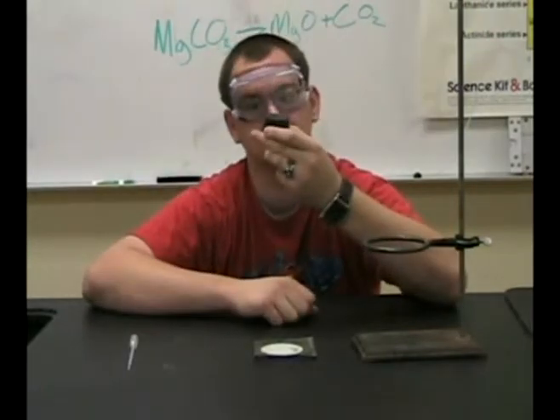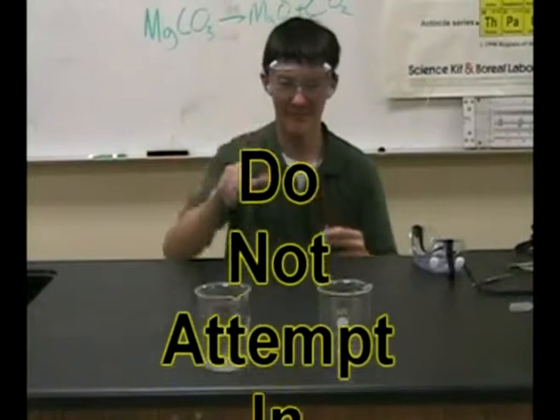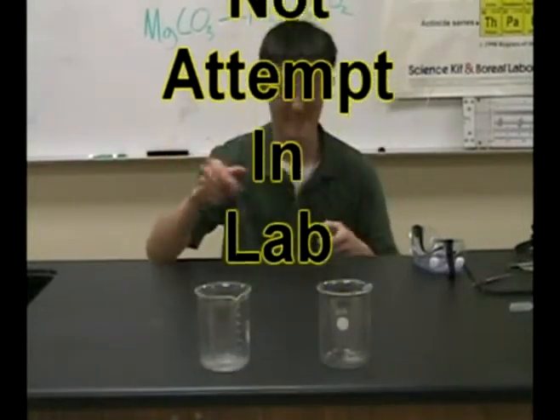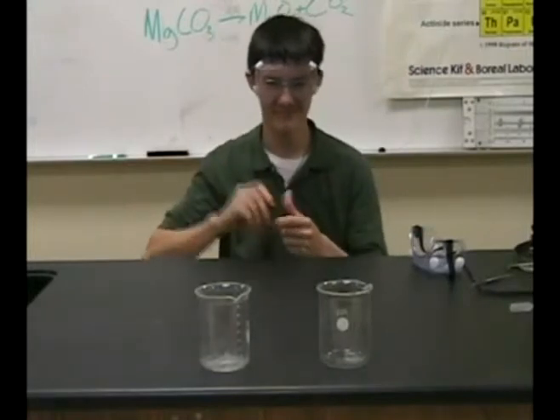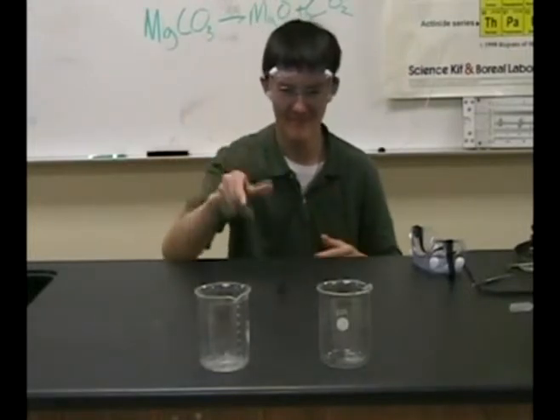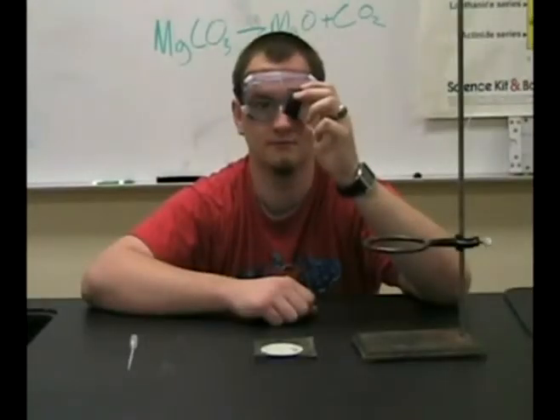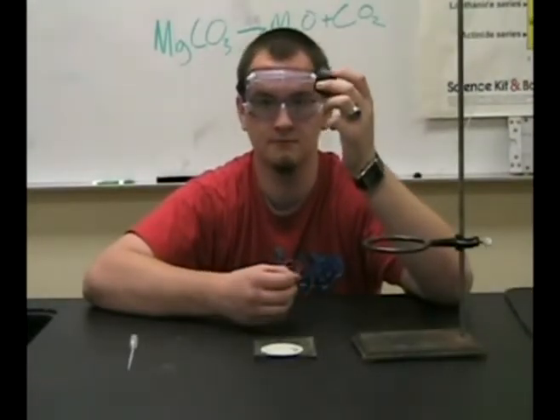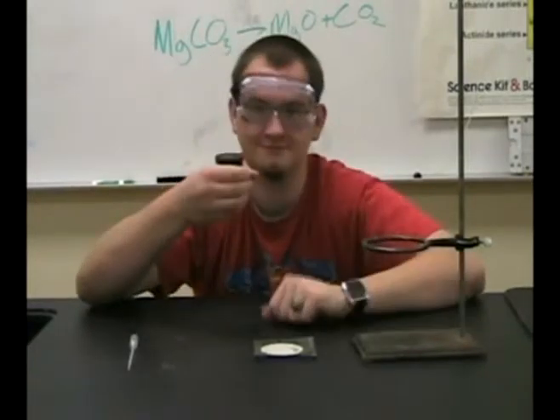They're also really fun to balance, but don't do this in the lab. To secure to a bottle, simply press a correct size stopper into the opening. You will probably notice if you don't have the correct size.